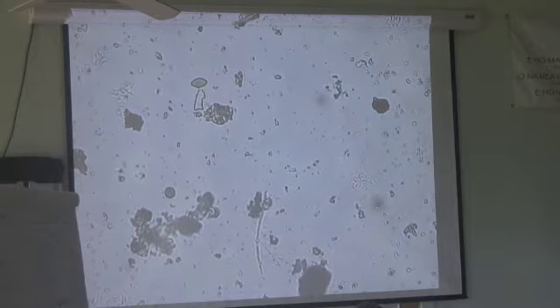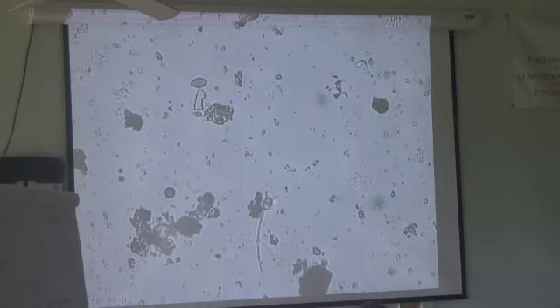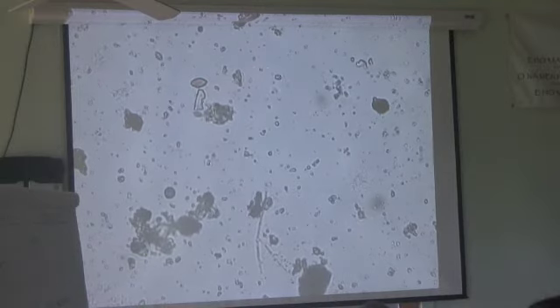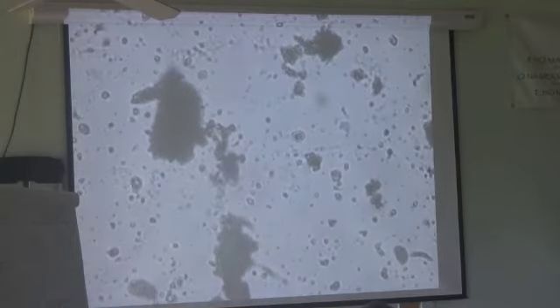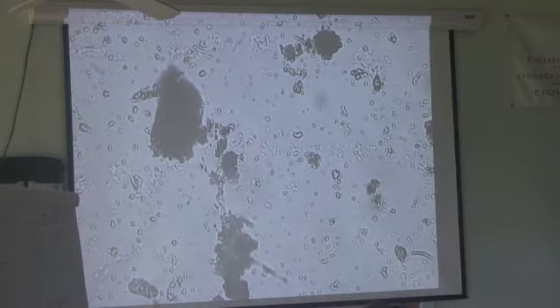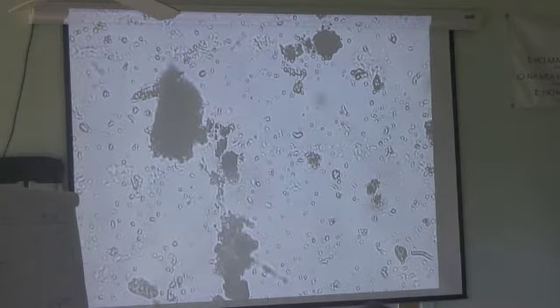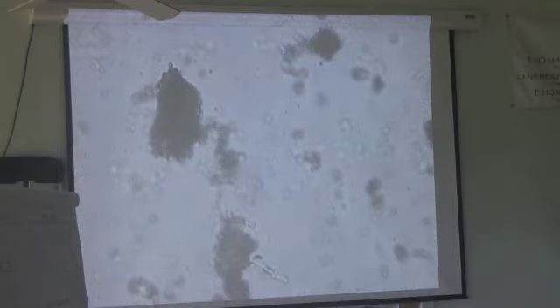So, flagellate right away, bumbling happily all the way along. You have a spore there, you have an actino. Probably a piece of pollen. Yeah, and that's it. We just got lots of bacteria, but we'll count them in a dilution layer. So what we're doing as we go through each field is we're just looking for absence or presence. We're looking for presence. We're going to record the things that we see in this field. And hopefully we'll run into some fungi here soon.